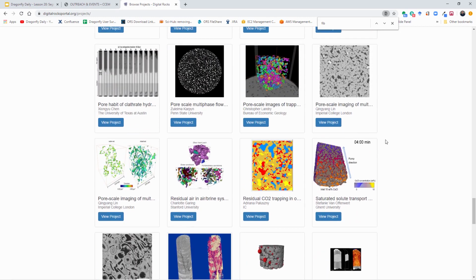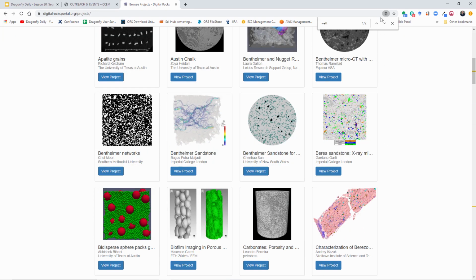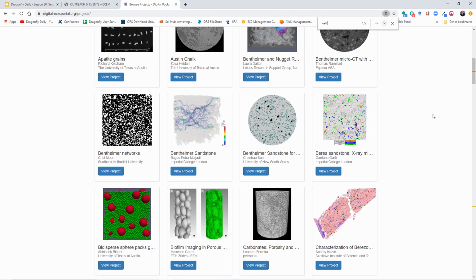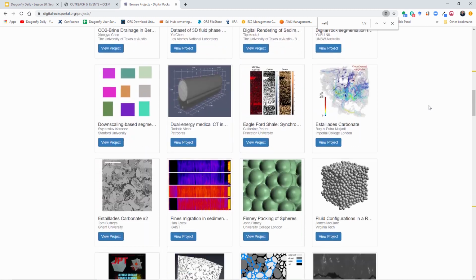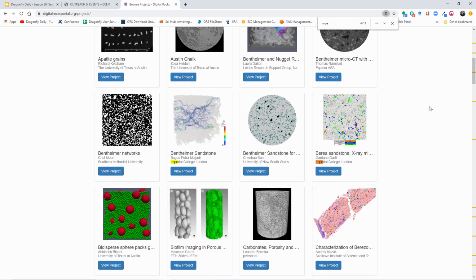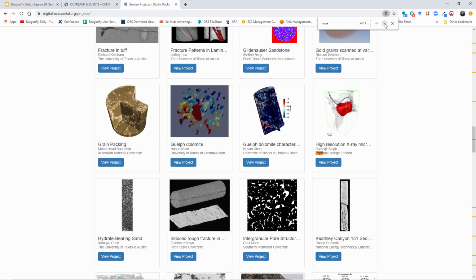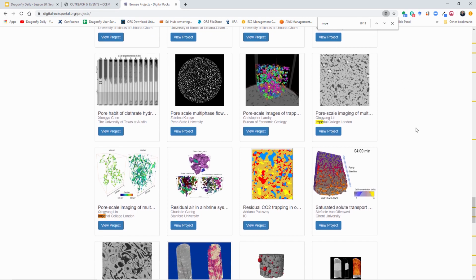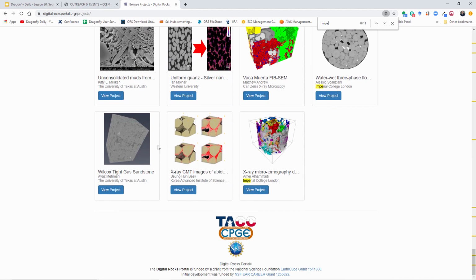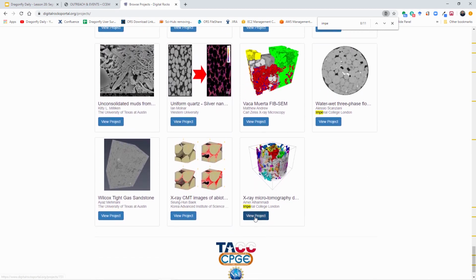Oh dear, I can't find it. Let's see if I search for Wettability. Do I find it? I can't even see where my search is lighting up. I'll search for Imperial College, see if that helps. Those guys have contributed a lot here, and you know what? I can't find it, and we'll come back and look for it later, because once I pull up the attribution, oh, you know what? Here it is right here.